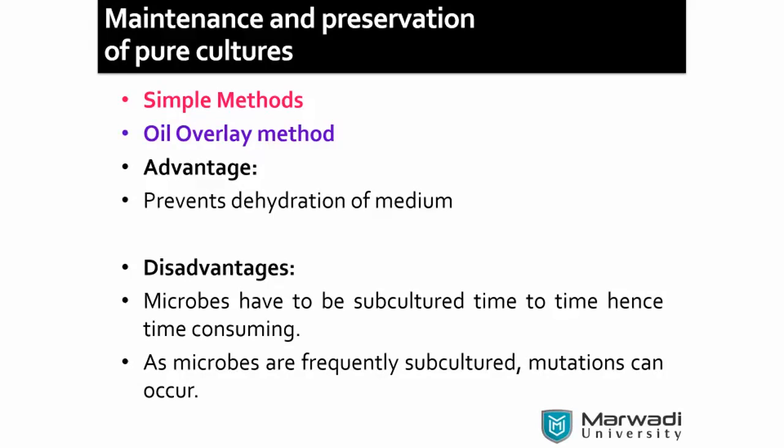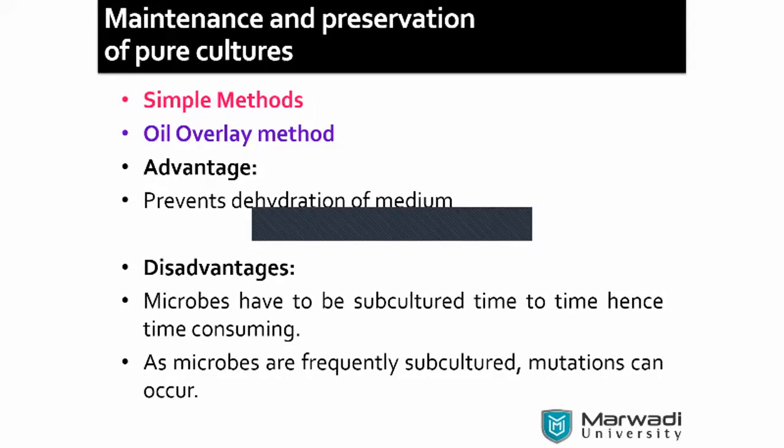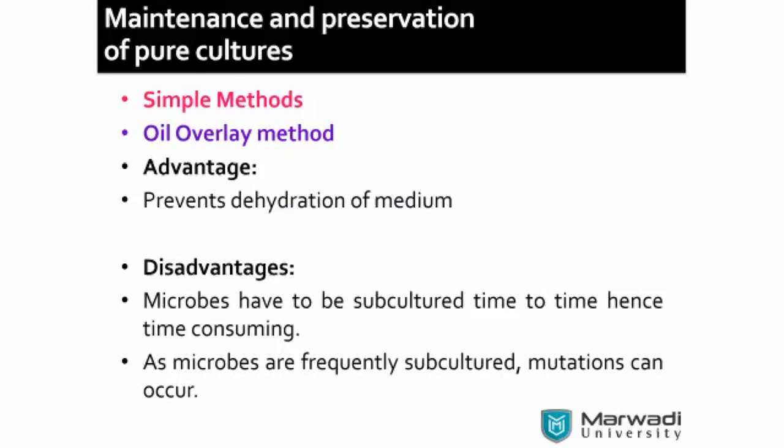So you may find that on the bottom, one tray is kept. It continuously gets filled. If there were any water vapors in the air, they get trapped, crystallized, and melted down again and taken up. So it is the basic phenomenon going on. Sometimes in the single door, one switch is given to defrost. At that time only, the surfaces start to get water and melt down the ice.